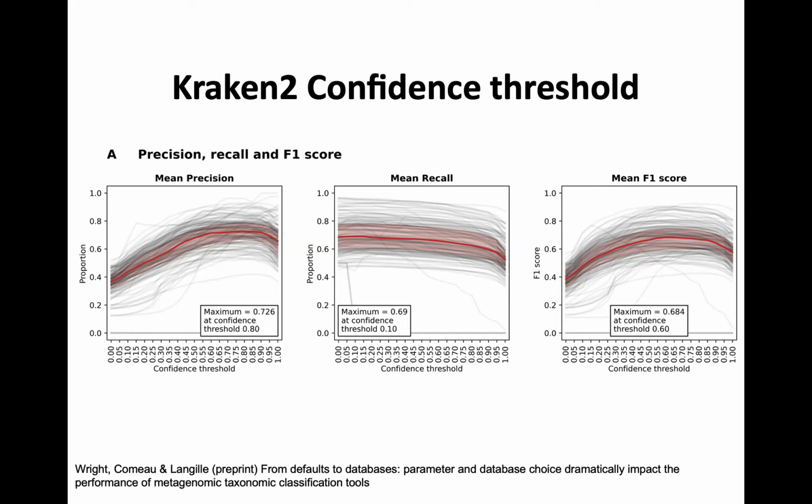Is this an easy fix? They just need to update the database a little bit, since Kraken can't do the job. So you can use this to inform how to update the database. No, it's not.